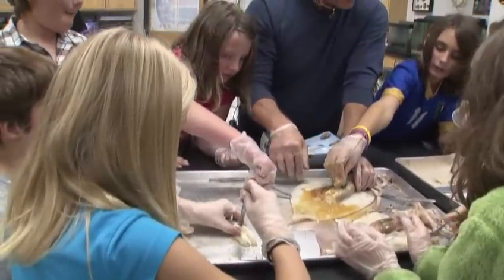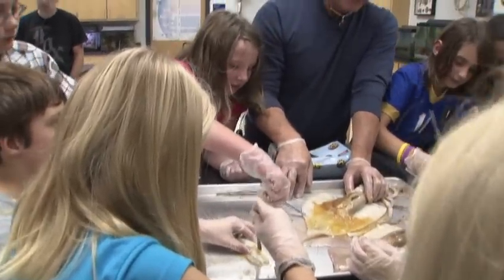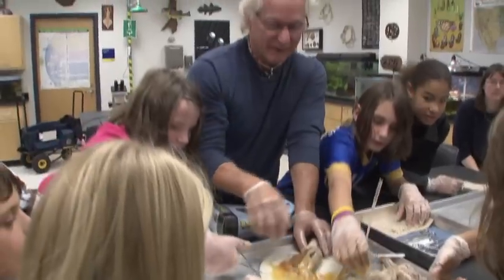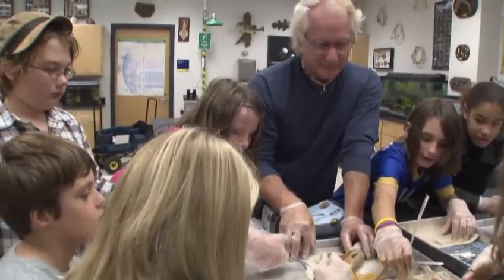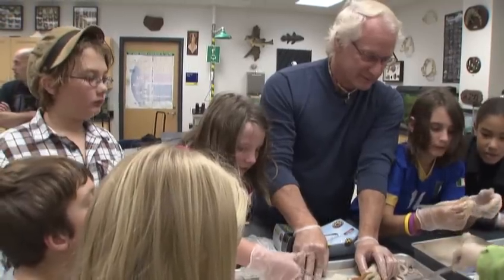So now you're going to use the intestinal stuff to draw your name? No, I'm still using the ink. Okay, because there's more ink over here. Courtney had a lot of ink there. It's not cut open. And you ruined the pen.